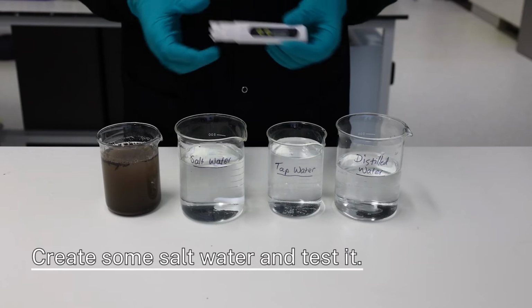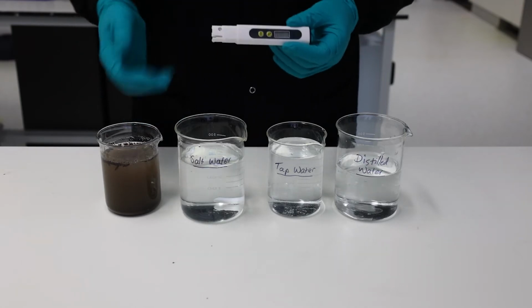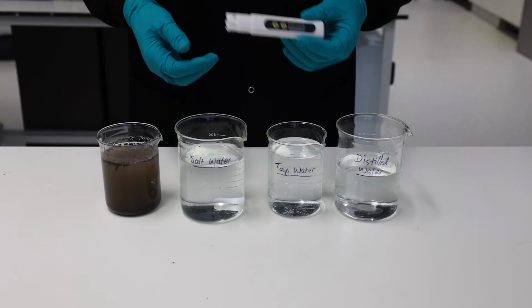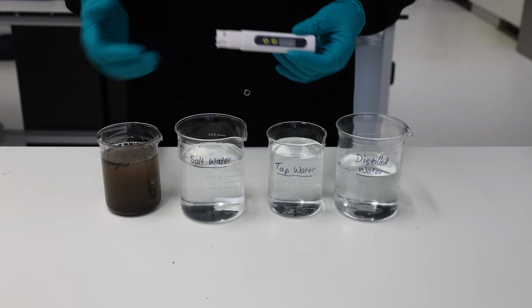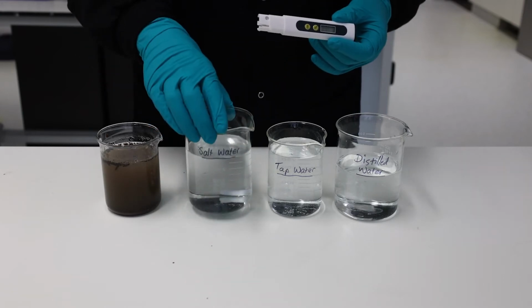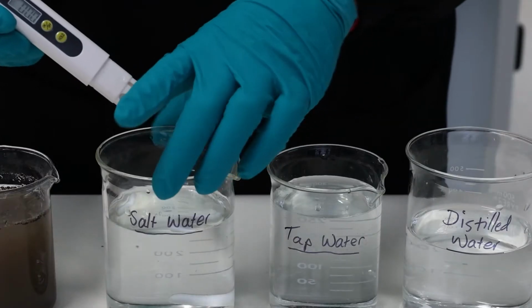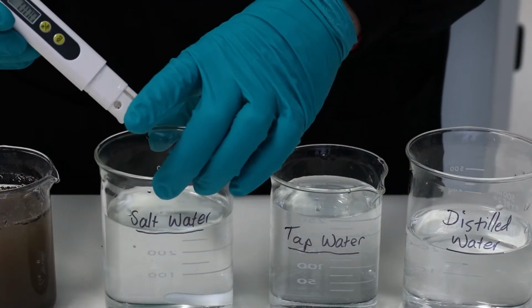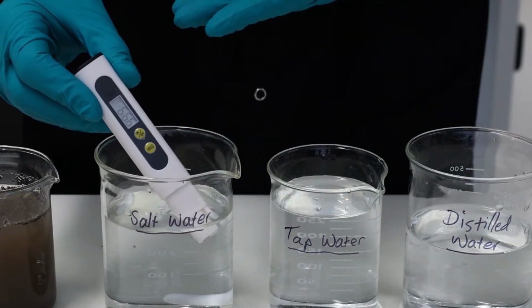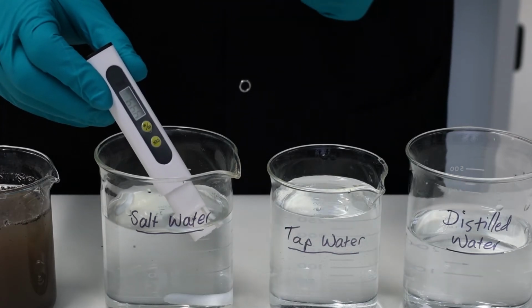Now, test water from another source, such as seawater from the ocean or river water. If you're unable to access these sources of water, you can try mixing up tap water with some salt, and then try adding soil to the tap water. Here what we've done is we've dissolved some salt in tap water to create a high concentration solution. So it looks clear, but let's see what the reading is. Whoop. The machine is maxed out at 999, so it's a very salty water.